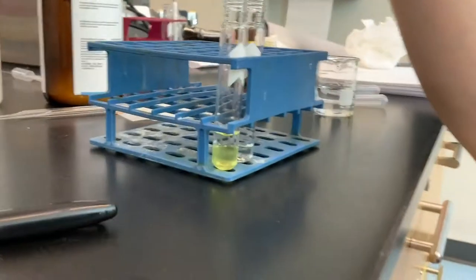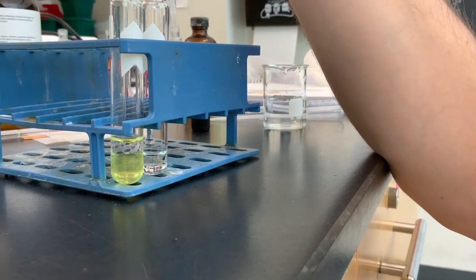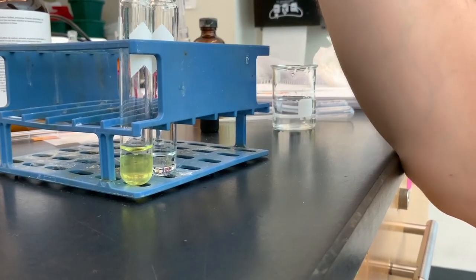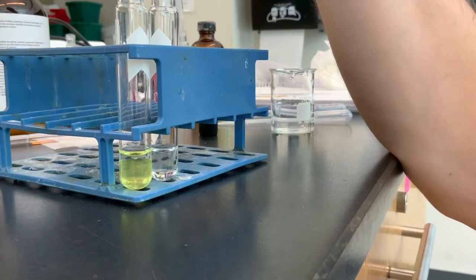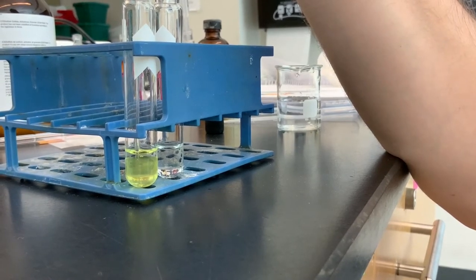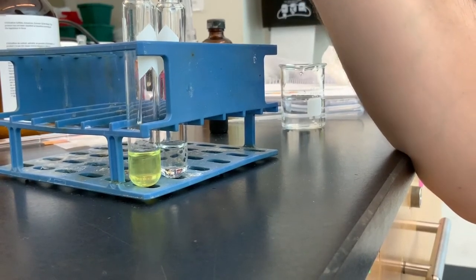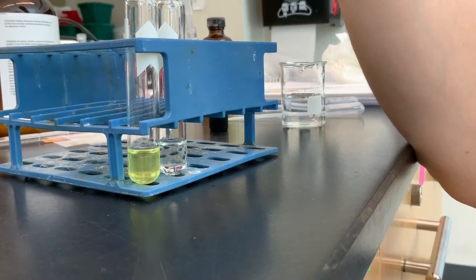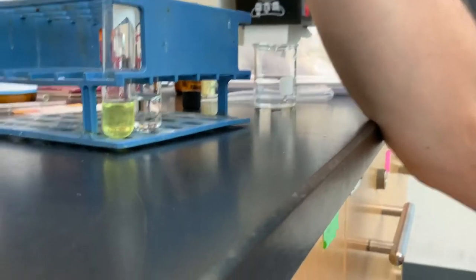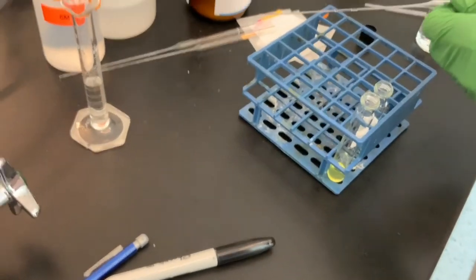And now, same Pasteur pipette, I'm taking the second aqueous wash out, and I'm gonna combine it with the first. And once again, we don't care about anything in this water. It's just to wash the organic layer and get rid of any residual acid. We definitely want to get rid of the water, because of course we want our organic layer to be dry. All right, so I think that's the best I can do with my pipette. So how do we get rid of the rest of the water? We use anhydrous sodium sulfate.